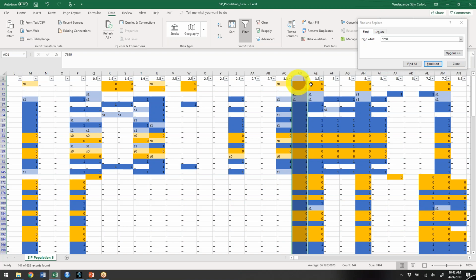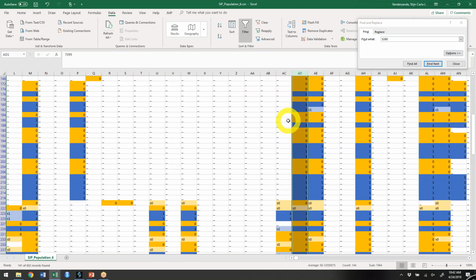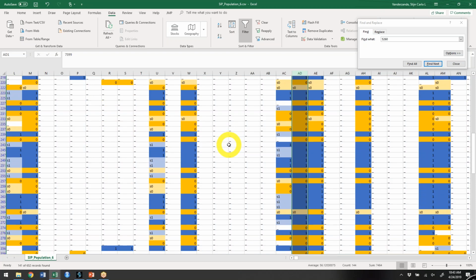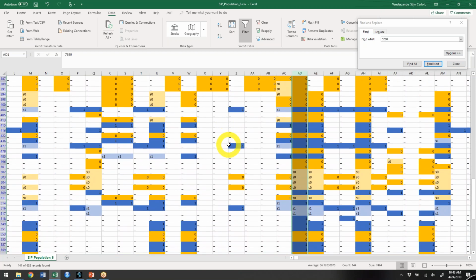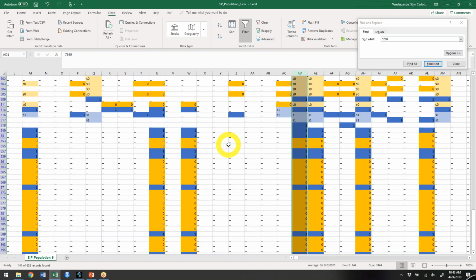And now we can scroll through this and just make sure that if I've moved this, yes, there's yellow on each side or there's blue on each side, depending on which this marker is. If we would do that, we would see that that works. The other thing that can work is if this is yellow and this is blue, but this is not yellow anymore. So a true recombination can happen as well. But otherwise, we can just scroll through this. And because we filtered, we have to look at much fewer individuals. And then we can see that, yes, this all looks really great.